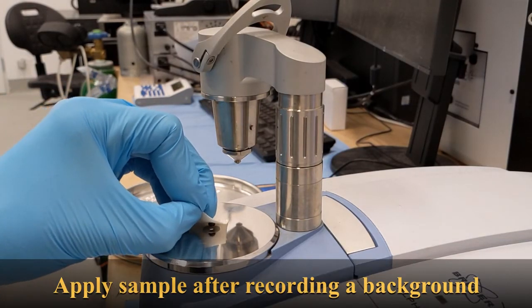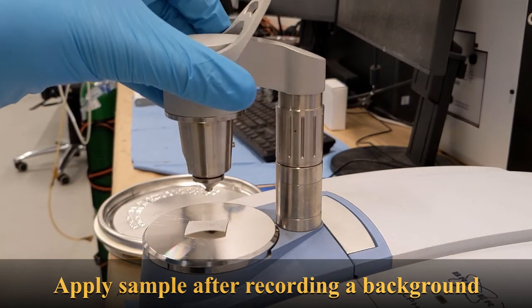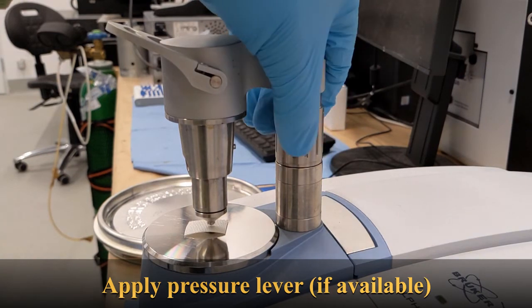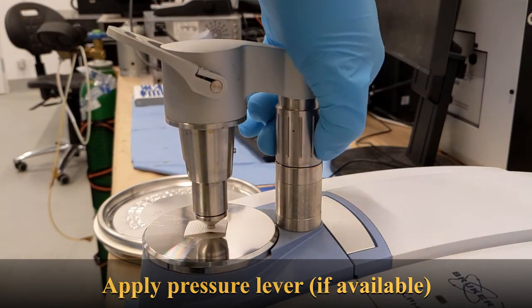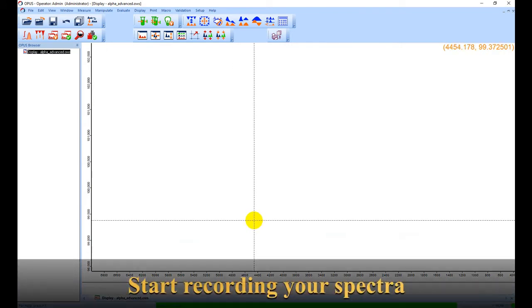You need to make sure that the bituminous sample is really in good contact with the ATR crystal, and make sure to apply a certain amount of pressure with the lever. However, do not apply too much pressure since you do not want to completely press the sample away from the ATR crystal. Once the sample is applied onto the crystal and you're still in preview mode, you should see a bitumen spectrum arising, and then you can start to measure your sample.